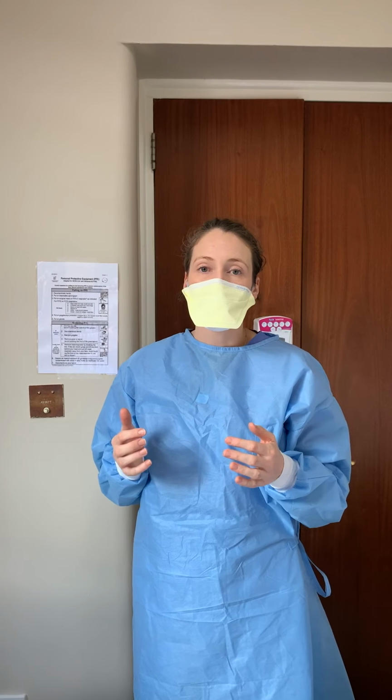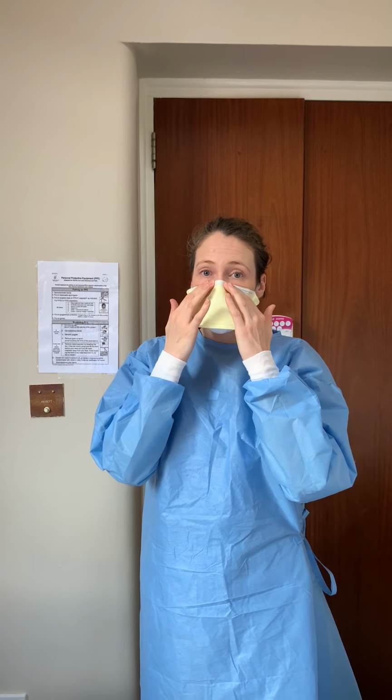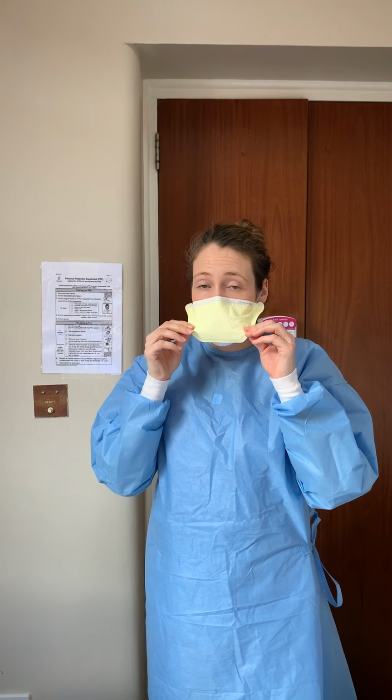In order to make sure the seal is effective, you need to mould the metal bit against your face and ensure you have a good fit under your chin. You can manipulate this by adjusting the straps. Once you've fitted your mask, it's really important to make sure that you have an effective fit by checking with a buddy. When you breathe in, the mask should collapse against your face and then return to a normal shape when you exhale. If you do not have an adequate seal, the best course of action is to remove the mask and attempt to refit it.